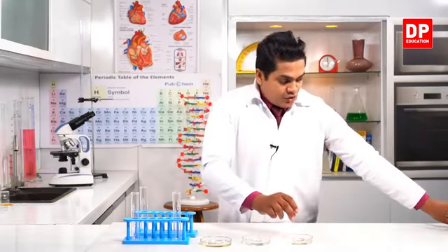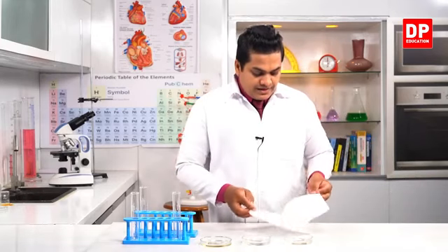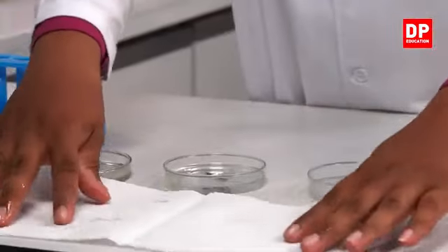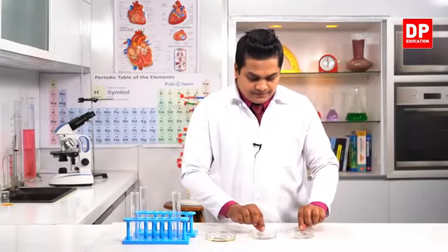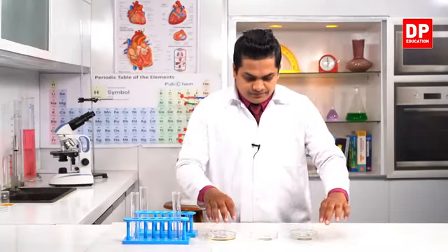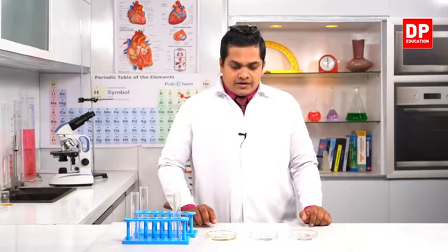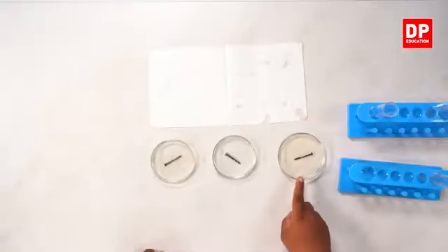So I'll use a tissue paper, and place each of these iron nails so that you can observe them very clearly. The first one, this one, contained normal water.